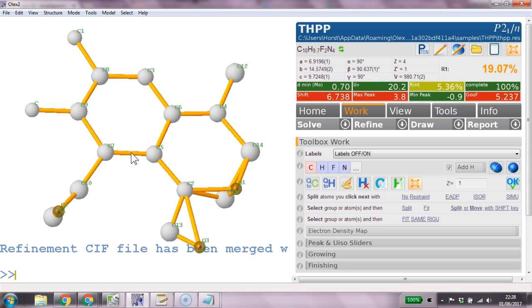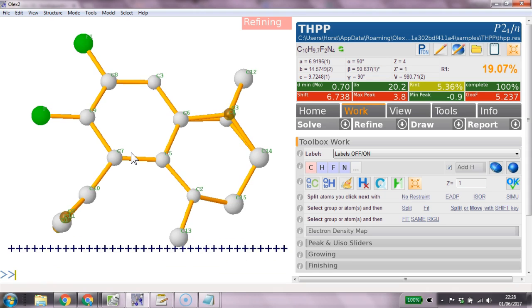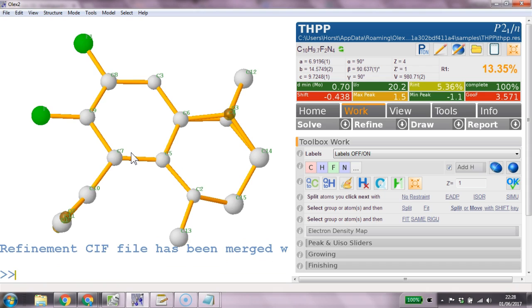So those ones on the top left hand corner they are fluorines we know this. So name C1F and then I think the one with let's just refine this and see what we get. Let's make four cycles of refinement I think to see where something else is going on.